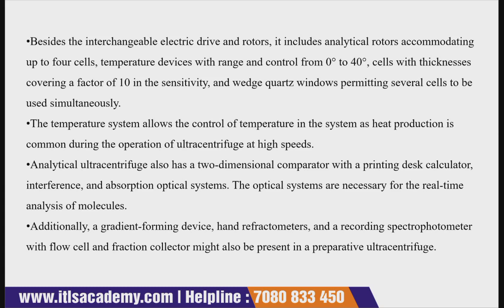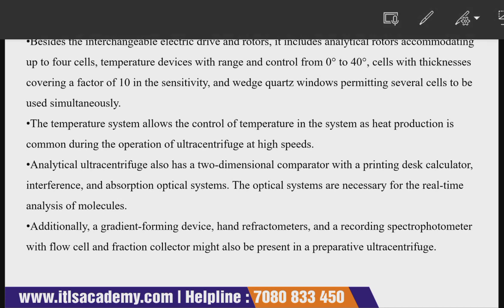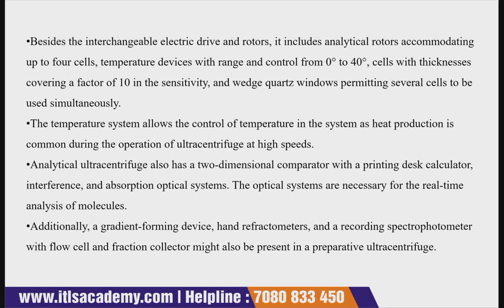Additionally, the gradient forming device, hand refractometers and recording spectrophotometer with a flow cell and fraction collector might also be present in the preparative ultracentrifuge. So this is an important thing to understand, that this system is giving a real-time analysis of any molecule, and additionally it also has a gradient forming device, hand refractometers and a recording spectrophotometer.